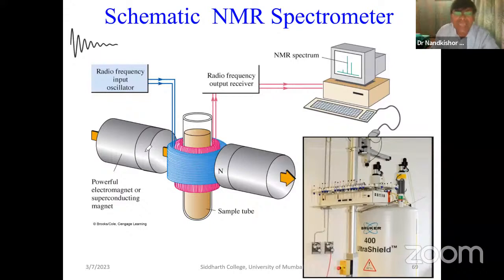And see, this is the exact schematic diagram of the NMR spectrometer. In this diagram, this is a dome where the supermagnet is there. This is the place over here where we have to insert the NMR tube. This is a robotic thing, so the NMR tube will be inserted here. And this is completely a robotic machine. This is considered to be a dome with a supermagnet.